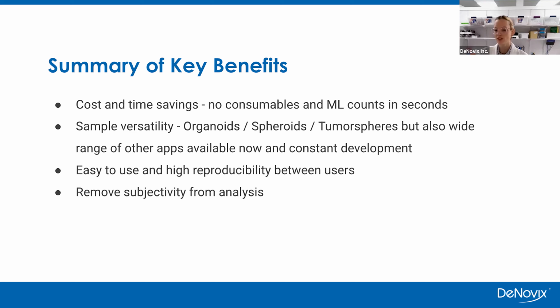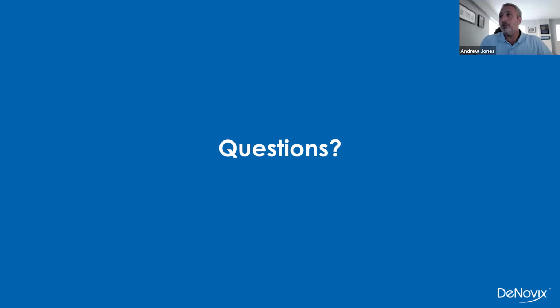So before jumping into the demo, I'll make time for any questions that can be dropped in the Q&A panel. Thanks, Grace. We've had some questions come in already, so let me give you those ones.